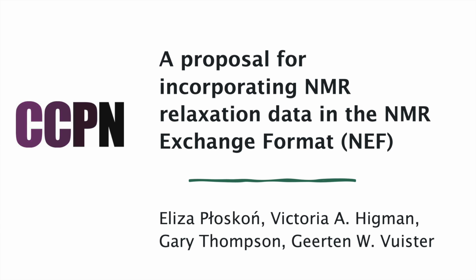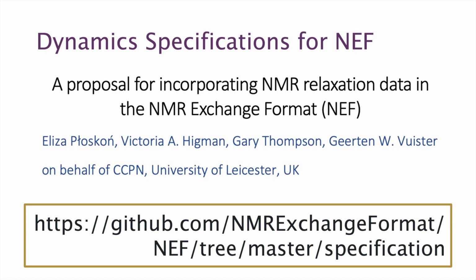Towards the end of 2024, members of the CCPN team published a proposal for incorporating NMR relaxation data into the NMR Exchange Format. The proposal document is available on the GitHub NEF page. We hope that many people will study this document in detail and provide feedback for improvements before it is put to the NEF Consortium for approval.